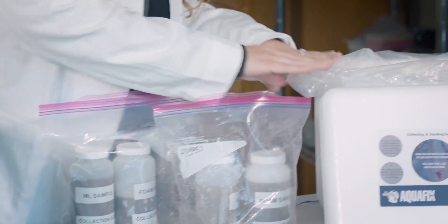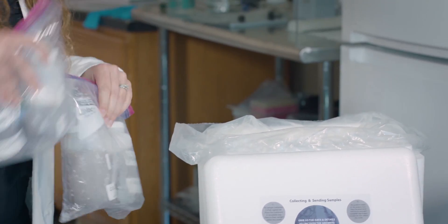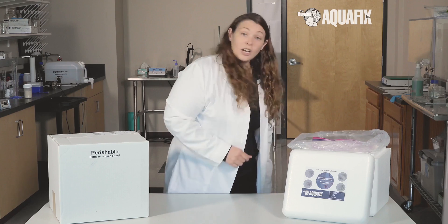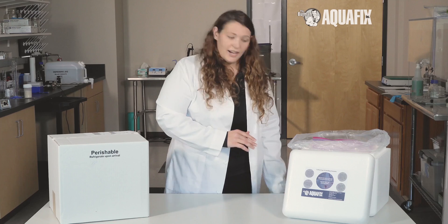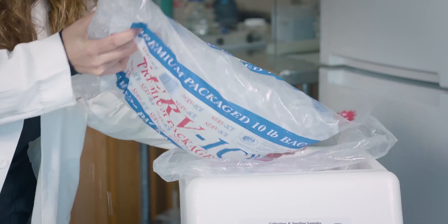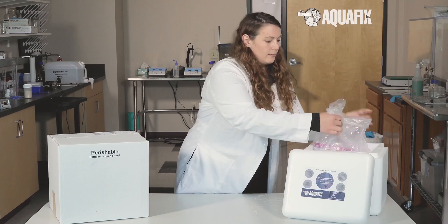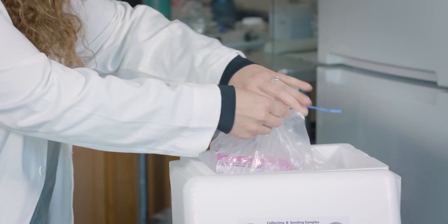Place the liner bag within the cooler and place your sample bottles in the center of the cooler, again remaining upright. Cover the sample bottles with ice completely. Twist the liner bag and use the twist tie to seal the bag shut.